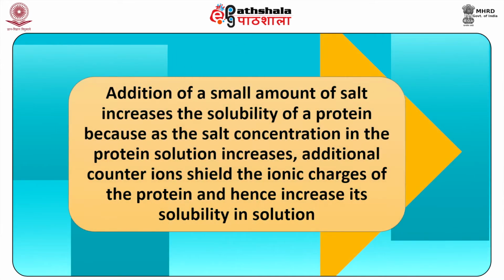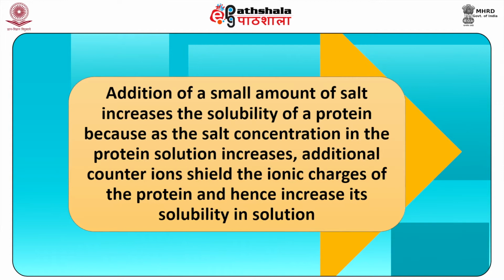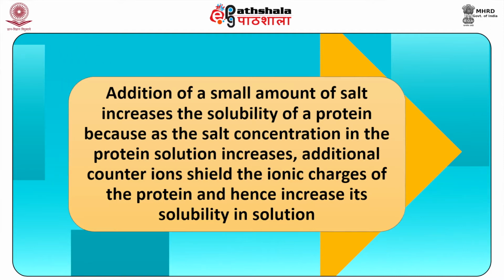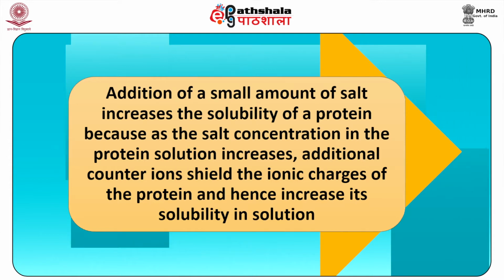Any protein in solution, we know, interacts with the solvent molecules by virtue of polar interactions. Now, addition of a small amount of a salt increases the solubility of a protein, because as the salt concentration in the protein solution increases, additional counter ions are now present to shield the ionic charges of the protein and hence increase the solubility in solution. So basically this is called a salting in procedure. Salting in means you are giving minuscule amounts of the salt, which in turn is increasing the solubility of protein.